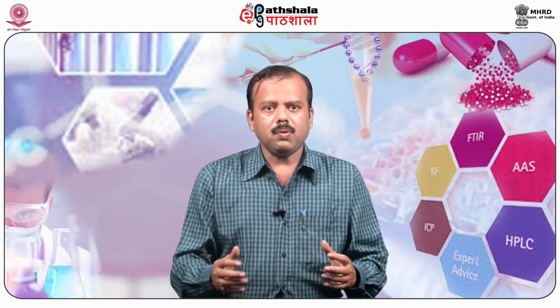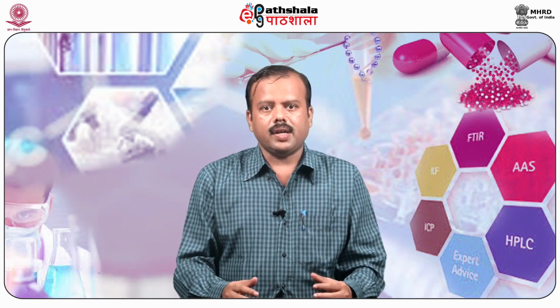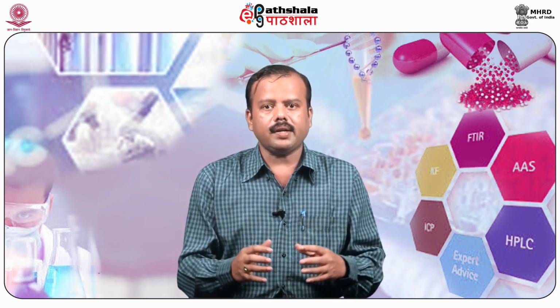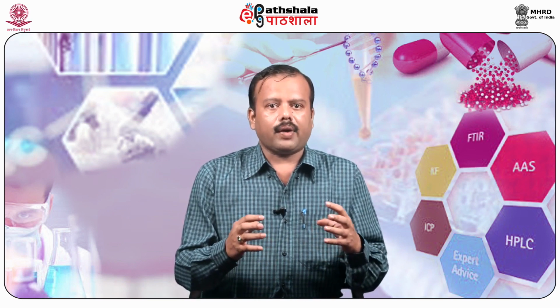Carrier test, also known as the Robert Koch method. The principle behind the carrier test is that a carrier such as silk, catgut or a penicylinder, that is a small stick, is contaminated knowingly with microorganisms.